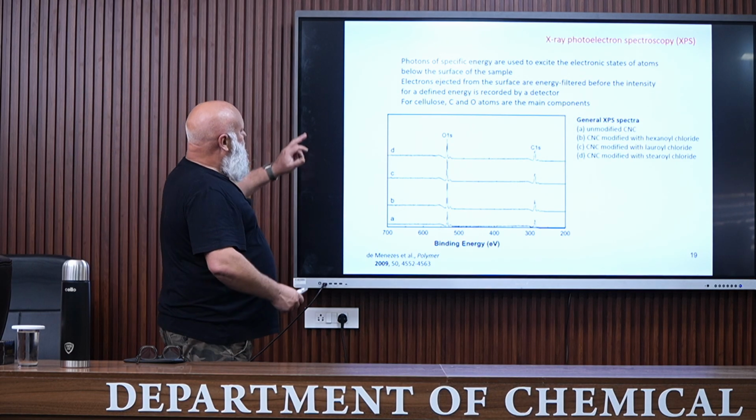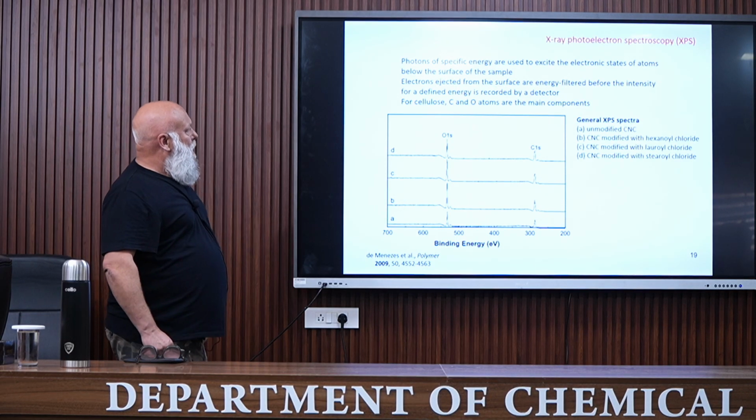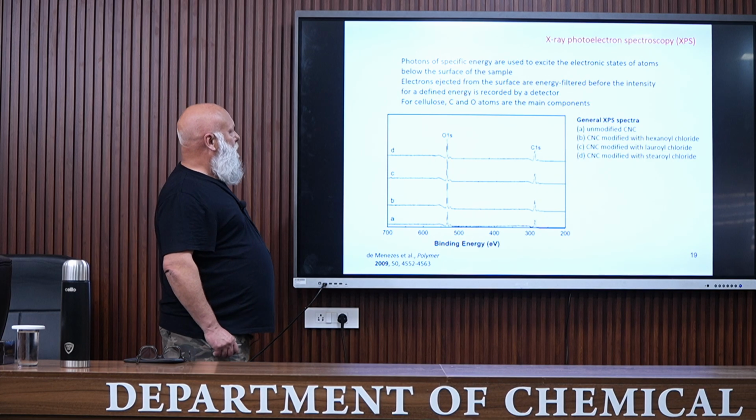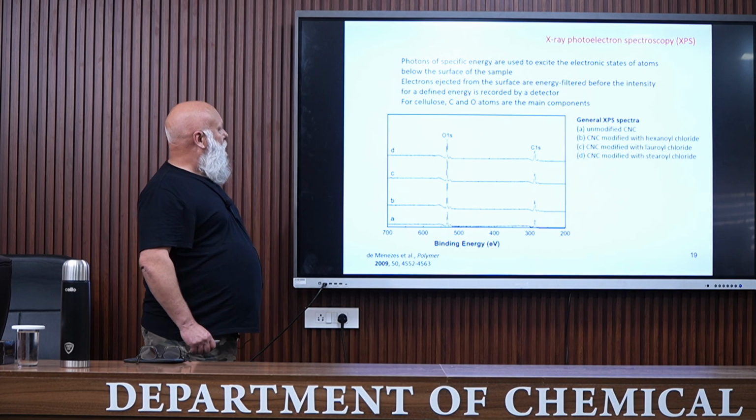In this technique, photons of specific energy are used to excite the electronic states of atoms below the surface of the sample. Electrons ejected from the surface are energy filtered before the intensity for a defined energy is recorded by a detector.